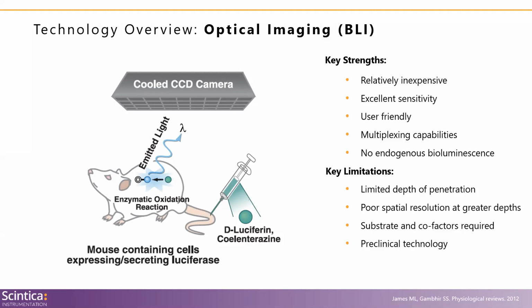And so if you think of a study looking at the treatment of a tumor, if you use something like MRI, it may take a month or two for the size or the volume of the tumor to look any different in MRI. But if your treatment is working, you should see those differences right away in BLI because within that tumor volume, you're going to have both live tissue and dead tissue. However, do keep in mind that this is a preclinical technology only.